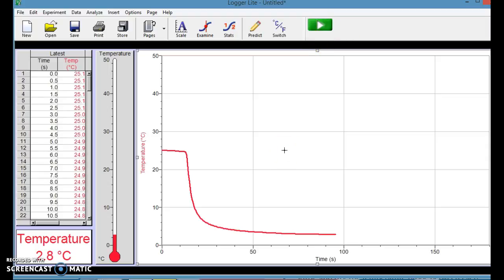and just show a couple of the analysis tools here. So this curved line here isn't a real good representation, but when I do a freezing point depression, I'll have a horizontal line turn into a vertical line, and I'll need to get an intersection. And this drawing tool, I have to drag it to make a straight line.